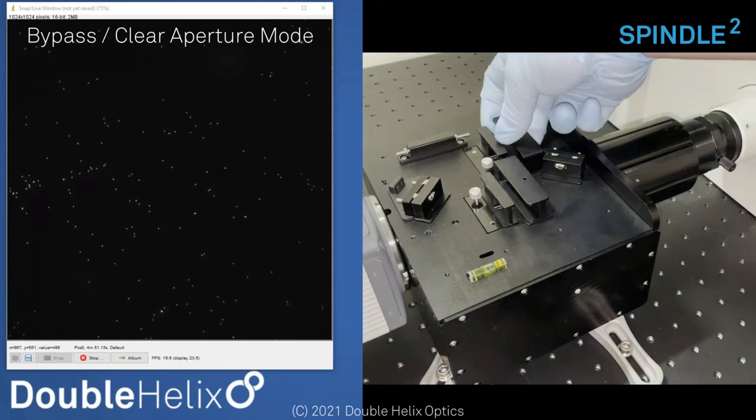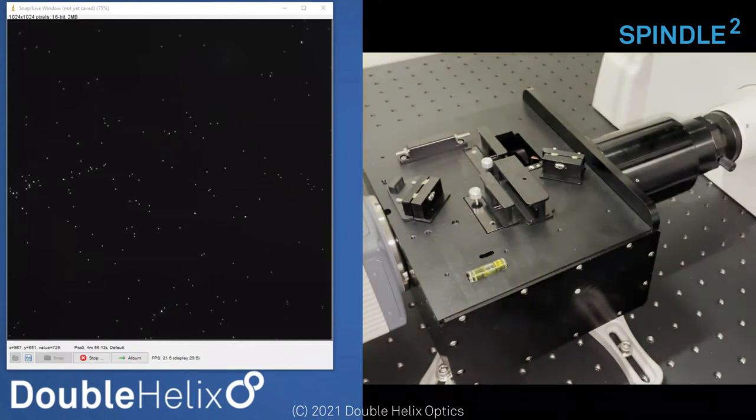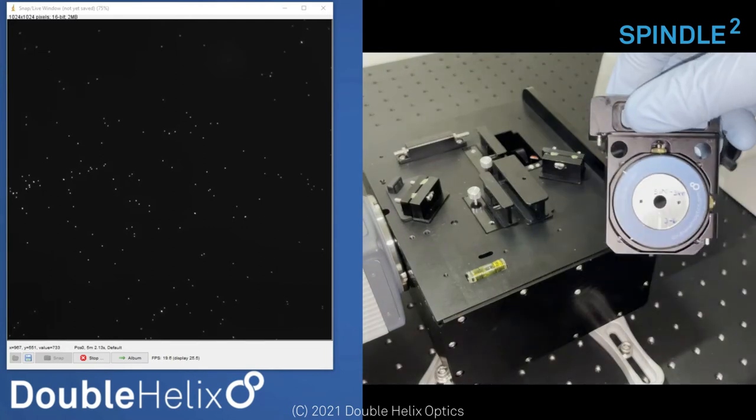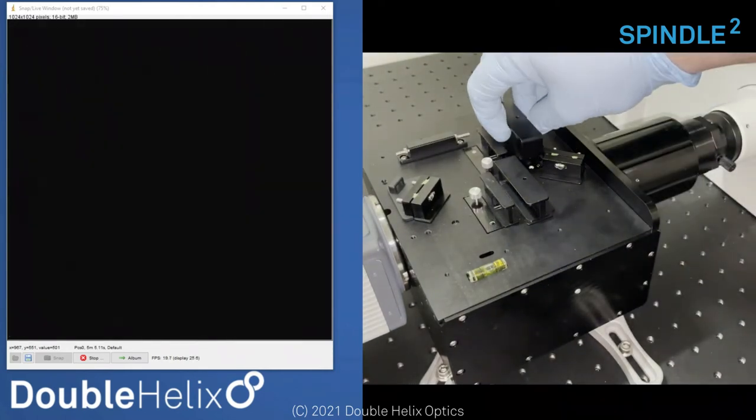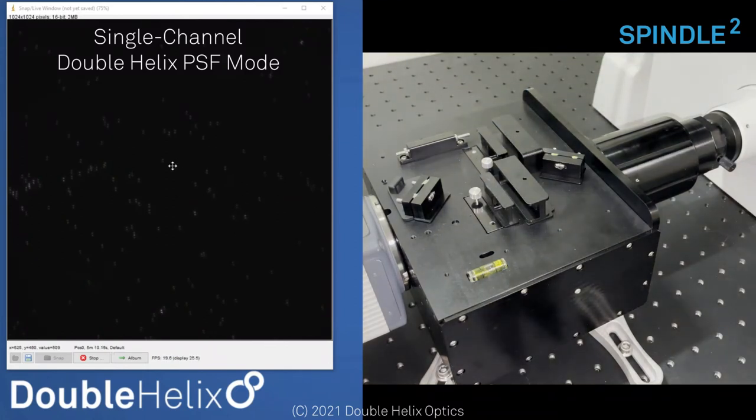If I pull out the empty phase mask cartridge and instead put in our double helix phase mask cartridge, now we're going to get those double helix PSFs. As I bring the microscope in and out of focus, the two lobes are going to rotate around each other — and that's how we do that 3D localization. We collect the angle and calibrate the system.